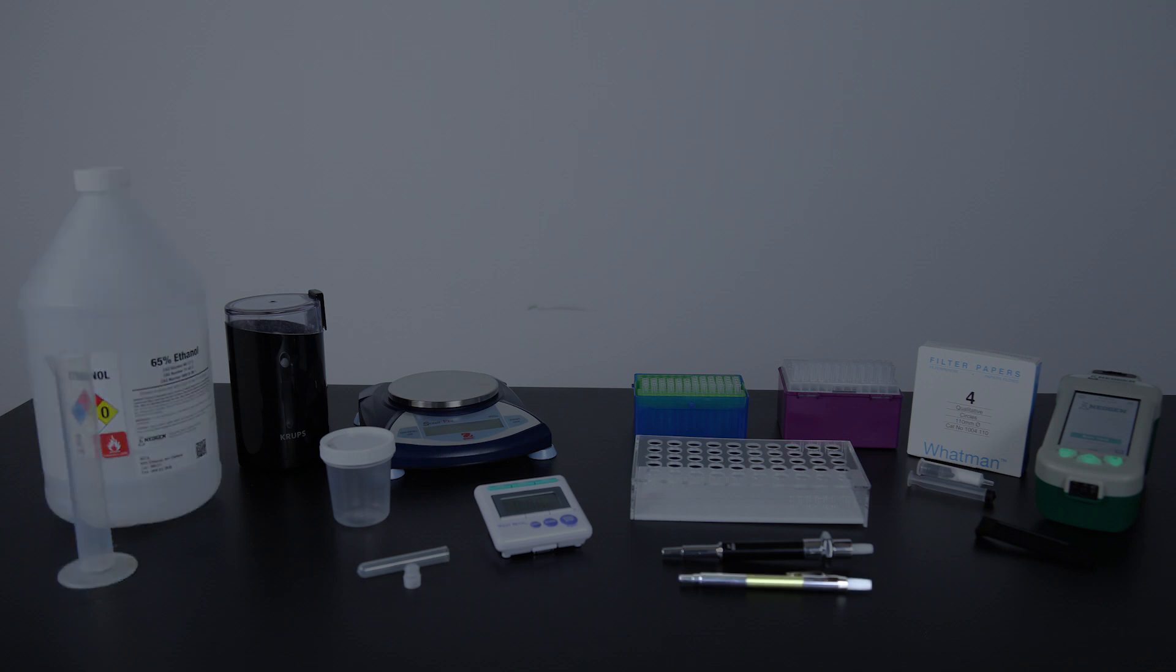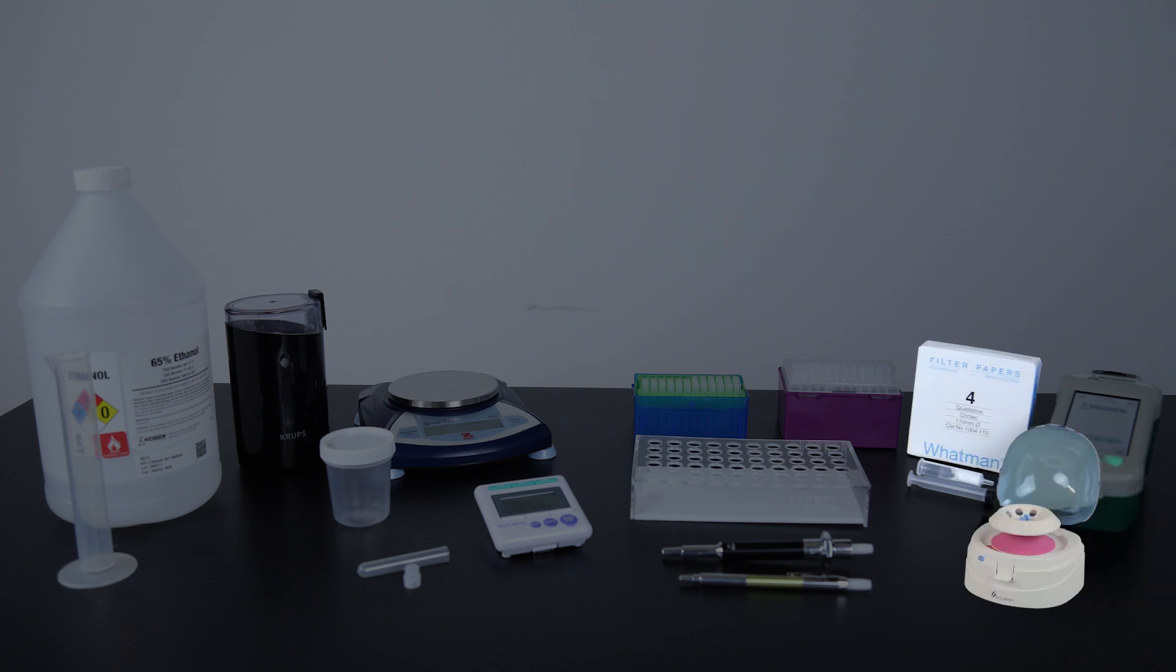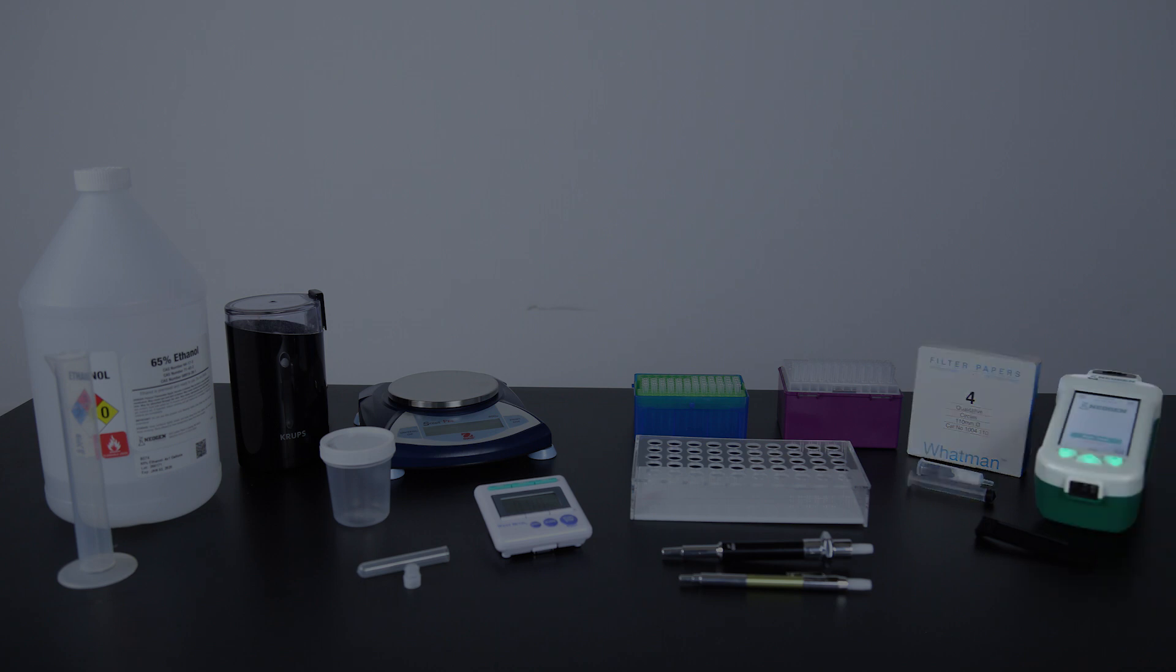You'll also need 65 percent ethanol solution, a 200 microliter and 400 microliter pipetter and tips, sample collection cups and lids, sample collection tubes and caps, filter syringes, Whatman number 4 filter paper or mini centrifuge and tubes, a Raptor Solo integrated analysis system, and Raptor cartridges.